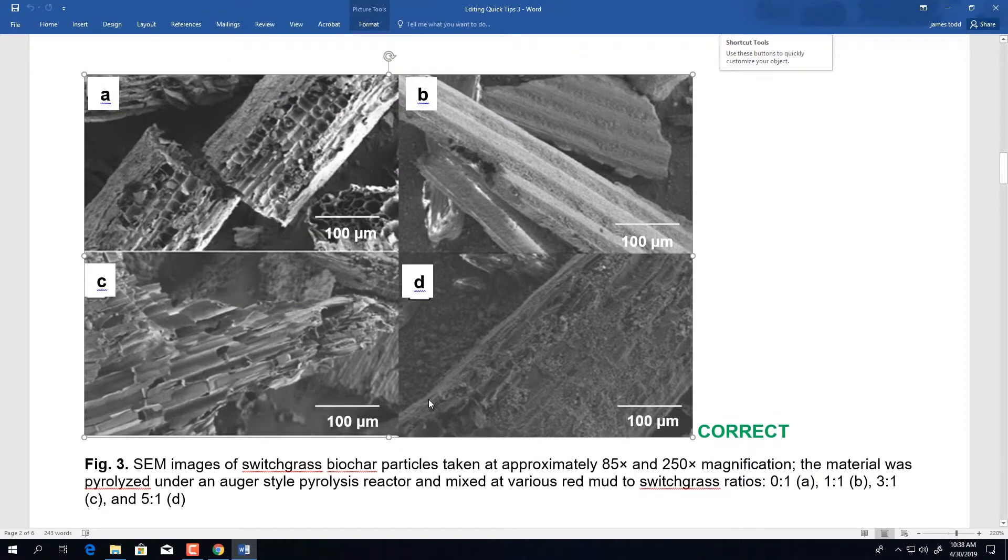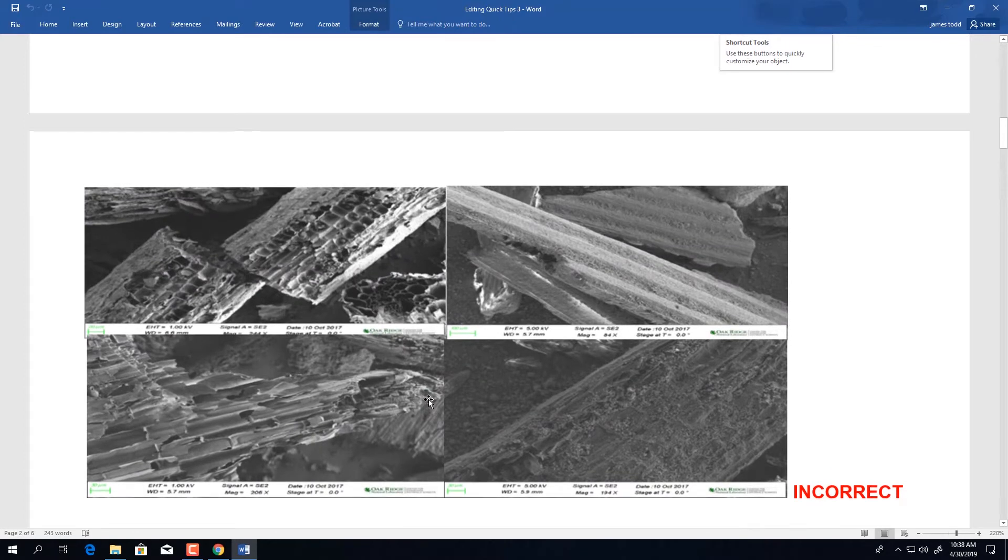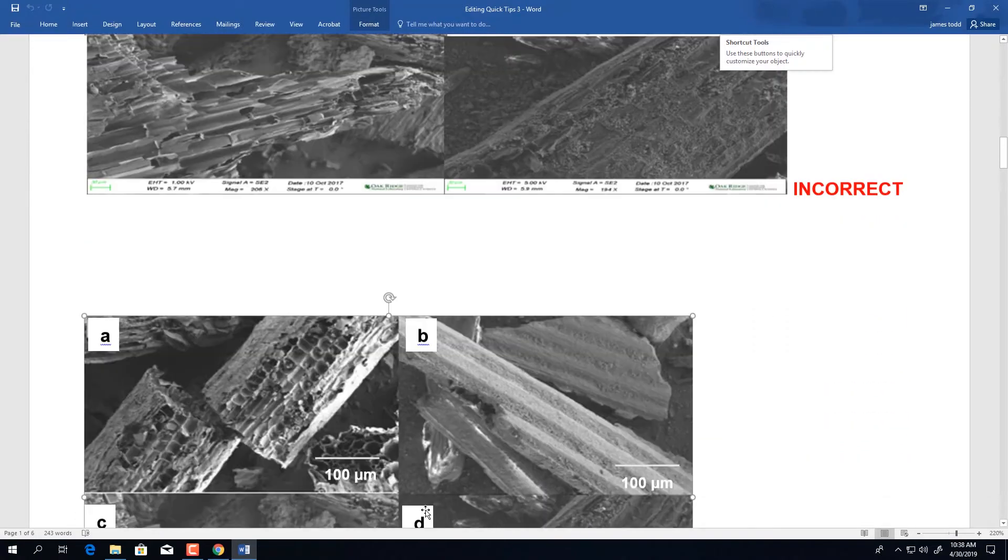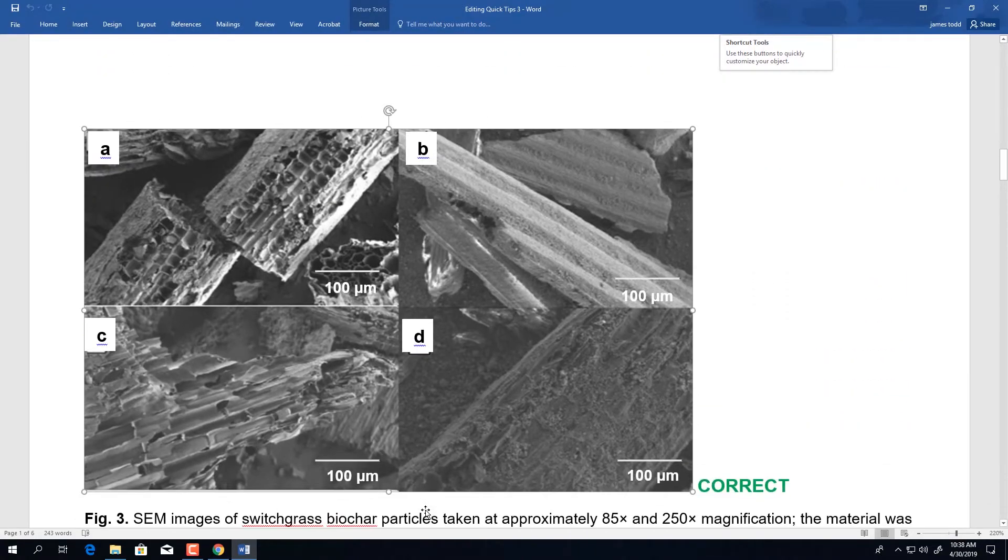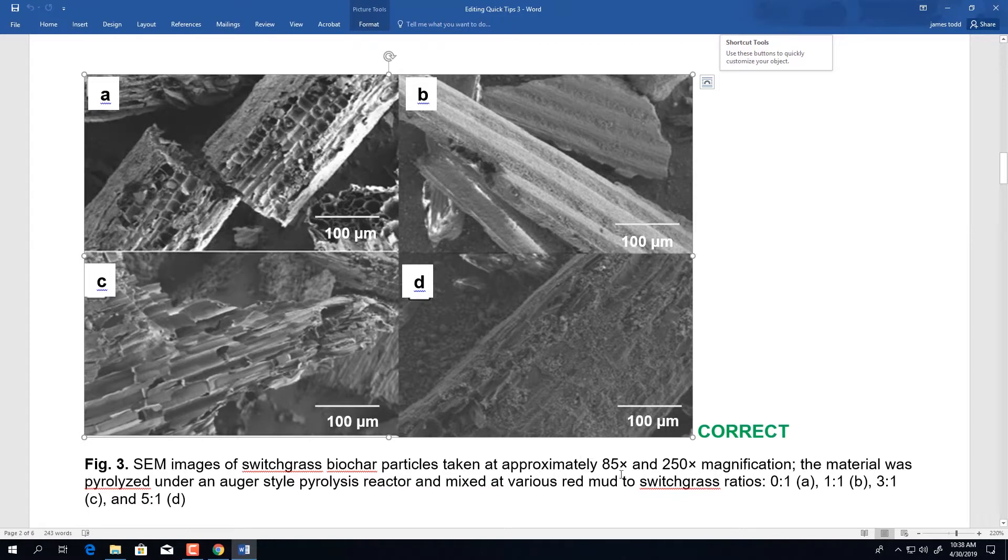Again, I'll quickly scroll through and show this image beforehand, which has the white bar of microscope information and the newly accepted image without the information and the correct information delineated in the figure caption.